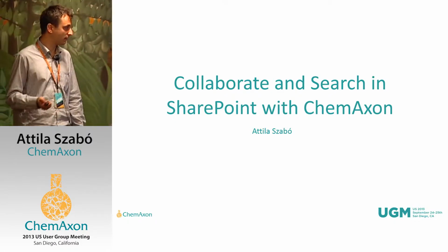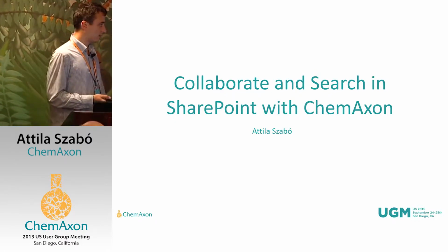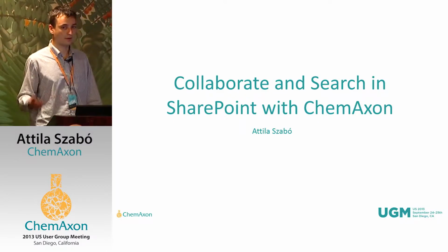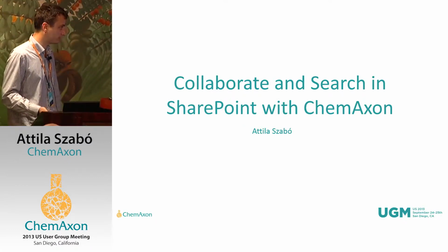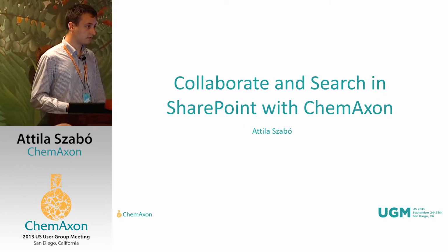One of my fields is our SharePoint extension. In this presentation, I would like to talk about how the ChemAxon platform is integrated into another platform, namely Microsoft SharePoint. Also, we'll give you an update on news.